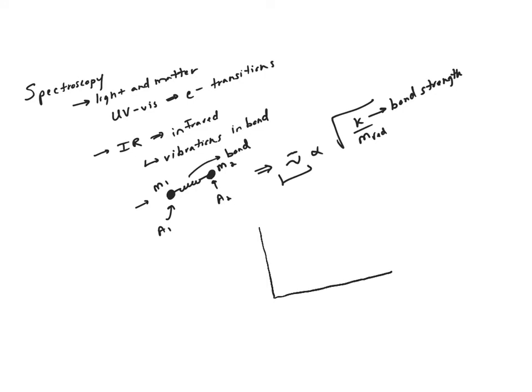actually be looking at absorbance, right? So here on our y-axis, we were looking at percent transmittance, right? And so if we essentially had a sample and all of the light went through, so nothing was absorbed, we would get 100% transmittance, right? This went down to 0. So if we had a sample and it actually absorbed a lot of light, essentially no light would get through, there'd be 0% transmittance, right?